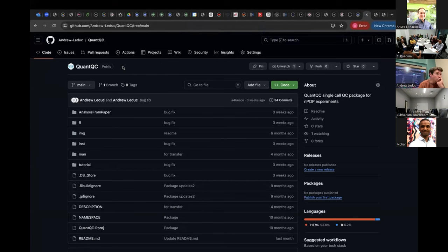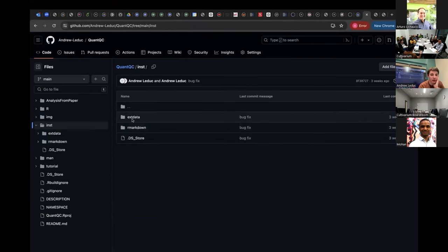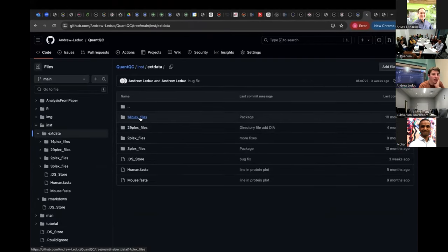For the plex stuff, when you're randomizing the labels, where would that data be? Would it be in the isolation files? Good question. It's actually in the fasta files themselves. This is my GitHub repository, and if I look in the extra data that I store, I just store the fasta files for the different plexes that we support in the back end. So the package is using this information, but I can store it all here, so you don't need to be grabbing these files every single time. But that's a good question.